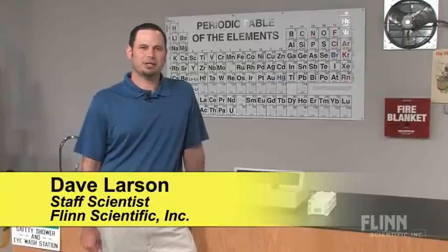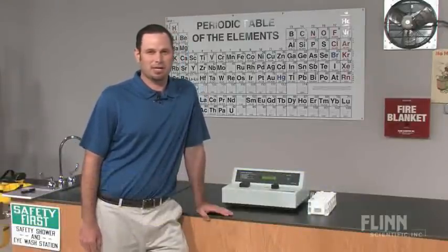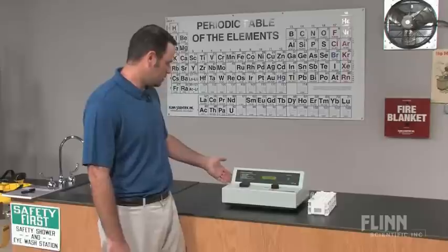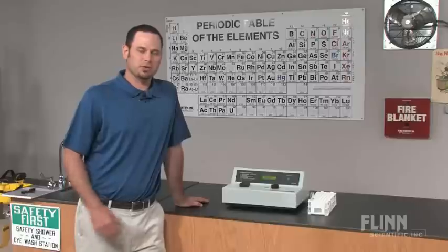Today I'm going to show you the basic operation instructions for the AP7026 Flynn Scientific Spectrophotometer. The first thing you want to do is turn the unit on, and you want to wait 15 minutes for the unit to warm up.